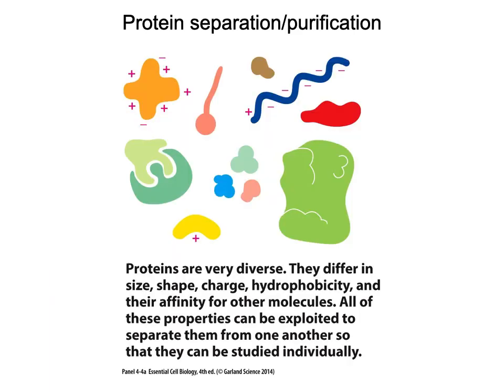So some of the different characteristics of proteins allow us to separate and purify them. As you're learning about proteins in chapter 4, proteins are very diverse. Their sizes differ, like how many amino acids are making them up. Their shapes differ, so how they end up folding together, whether they're a single subunit, a single domain, or multiple domains or multiple subunits coming together.